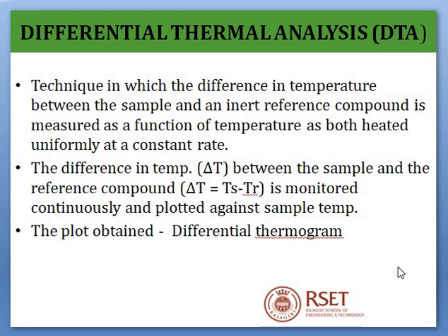Next is differential thermal analysis. From the name itself, differential thermal analysis, difference in temperature is plotted against temperature. That is, you need a sample and an inert reference compound. The inert reference compound means it is thermally inert at a higher temperature.